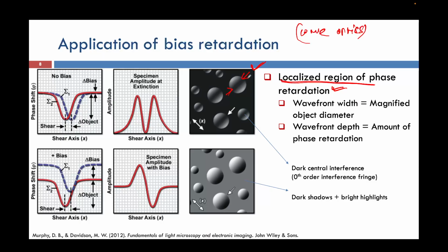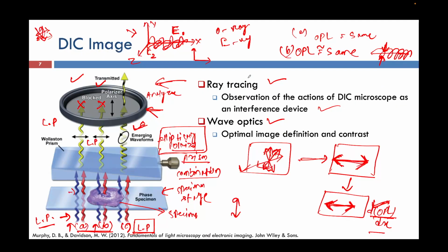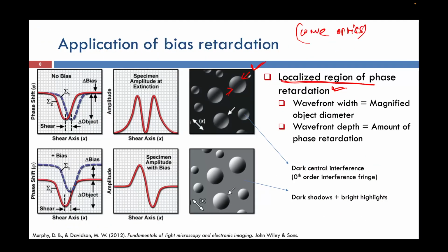So here, generally in case of C, which I showed in the previous slide, I will get a picture or an image like this. But what I want to imply is that though I am getting a picture like this, I am getting some dark fringes in the middle, and also this dark background. So I want to still view my image in a better way. So how will I be able to do this?